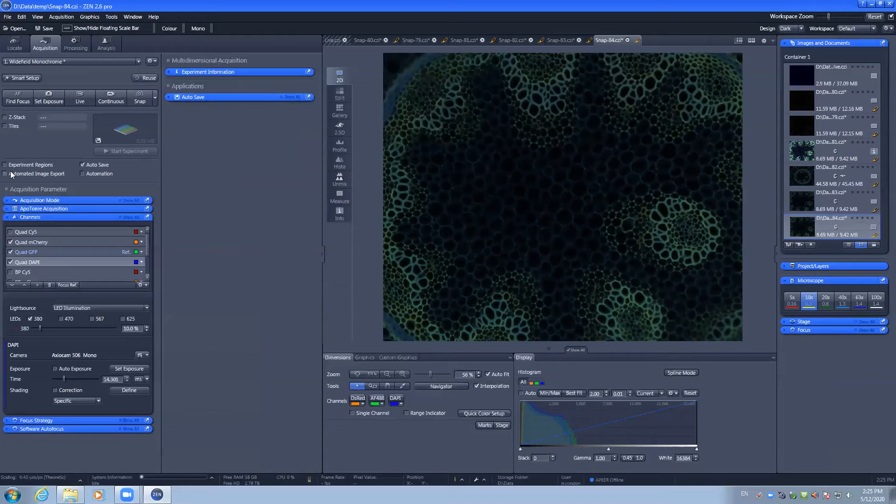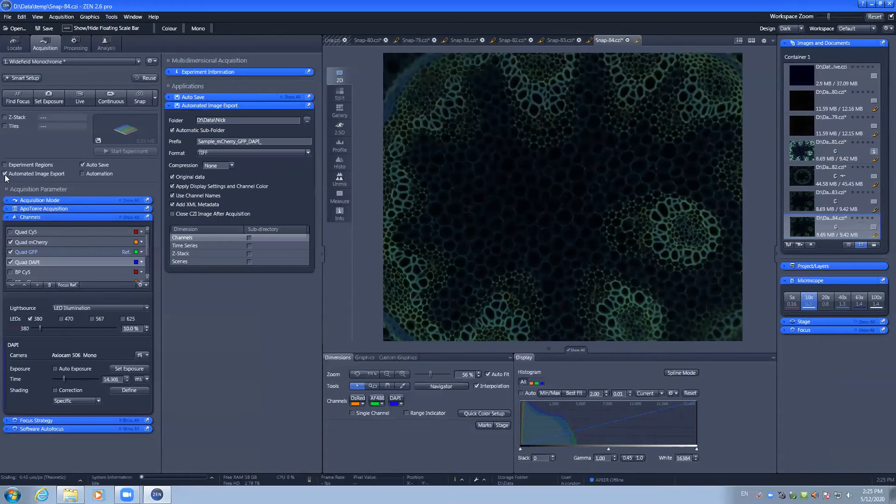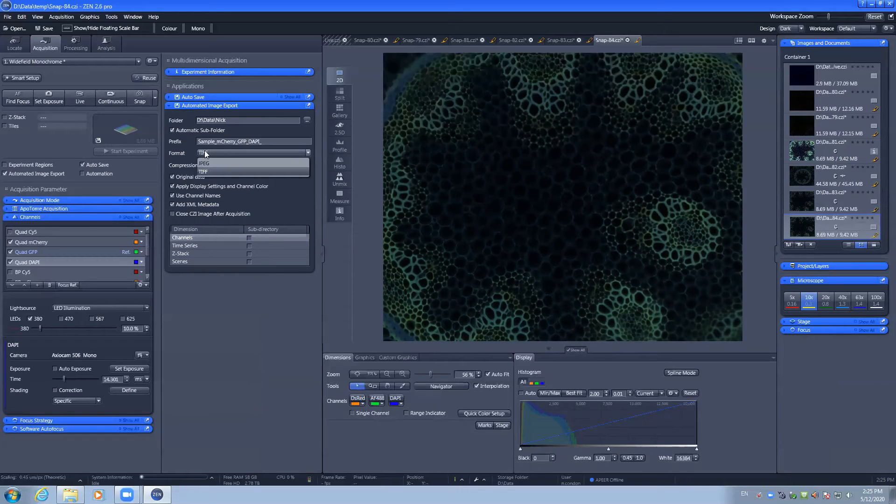There is also the ability to automatically export images. This will allow you to take out TIFFs or JPEGs.